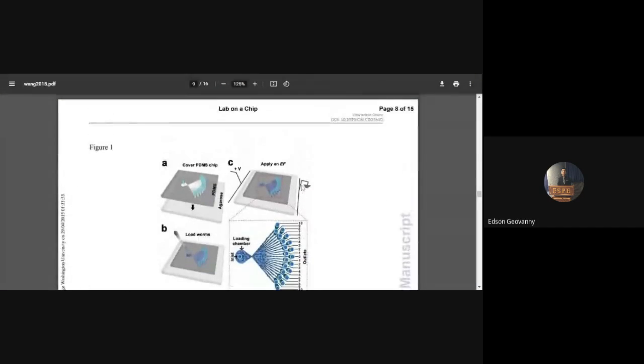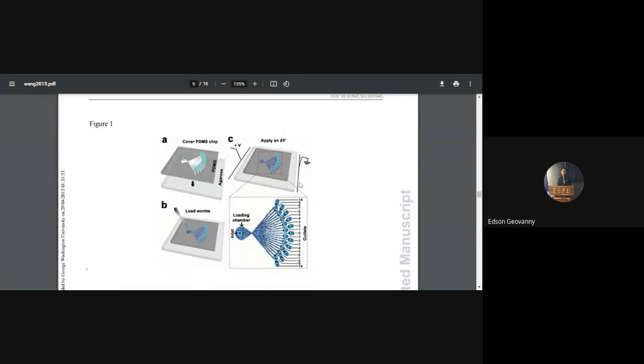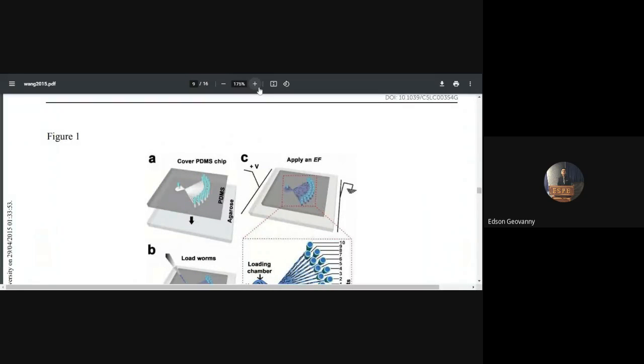This article discusses a cost-effective approach to performing C. elegans classification. The chip has several classification channels with specific angles when applying the electric field. The stages of C. elegans are dragged to the negative pole. Therefore, the worms separate and synchronize in a stage.